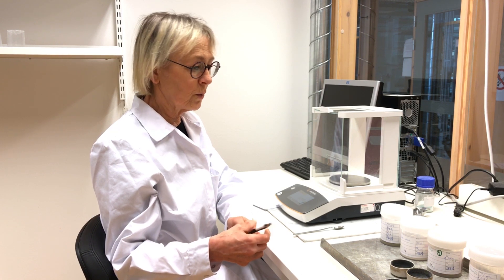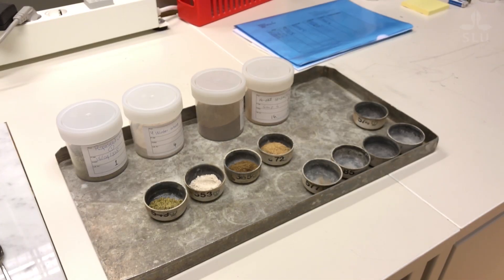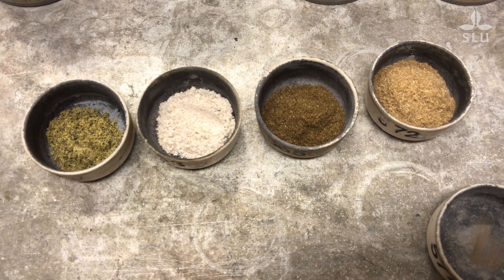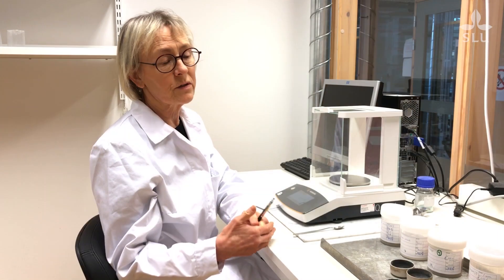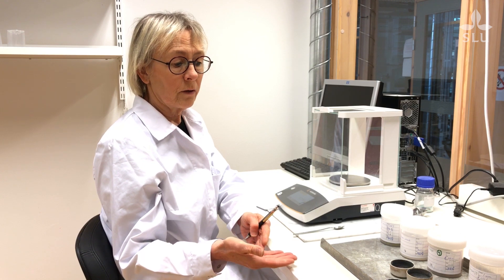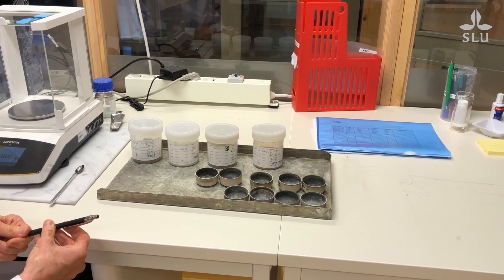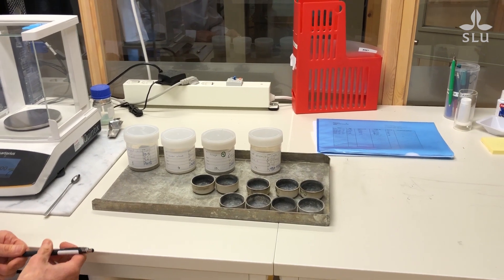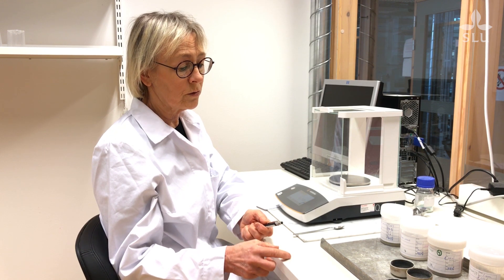Your samples that you will get in the lab have been prepared. We have pre-dried them at 60 degrees overnight and then we have milled them. We do this drying because we need a stable sample. If the sample is too dry it will absorb some moisture from the air, or if it's not dried enough it will dry out while we store them, because sometimes we might analyze some extra components or do some extra analysis after half a year or something like that.